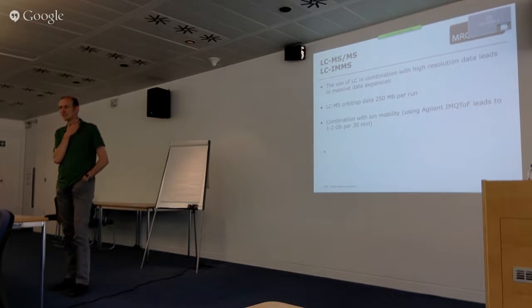We'll regularly try to find out what they're doing, but that's something we definitely want. Yes, it's always been so, because if you have everything in good shape, then it makes it much easier to move data around and later find it again. That's no issue, that's all we do. Although it's not an official LIMS system, that's all in place.